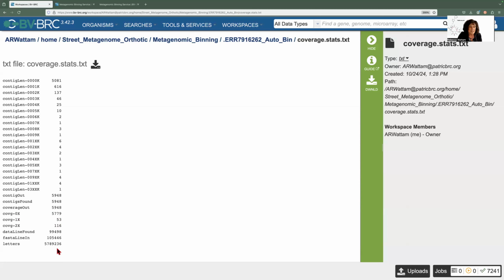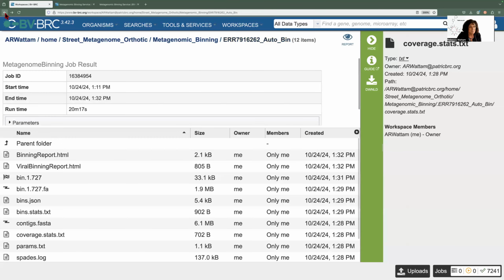I don't care about this stuff. But see, it's easy peasy, easy to understand once you look in a little bit of detail. Okay, not that easy, but I'm trying to help you out here and help myself out understanding it.